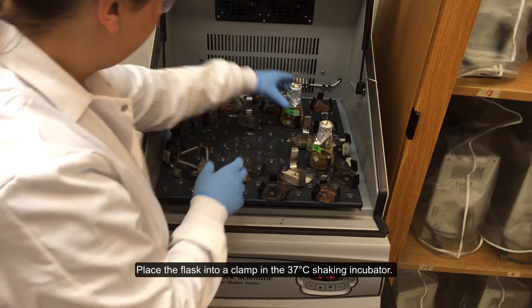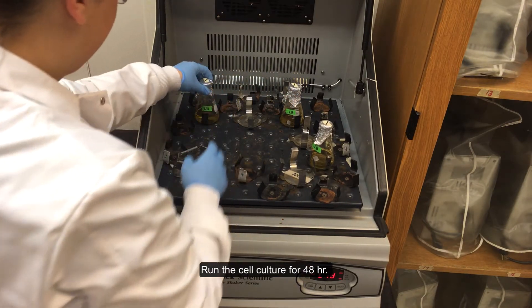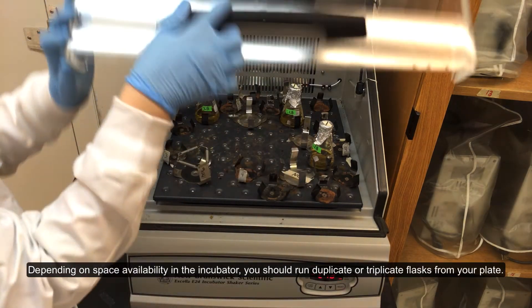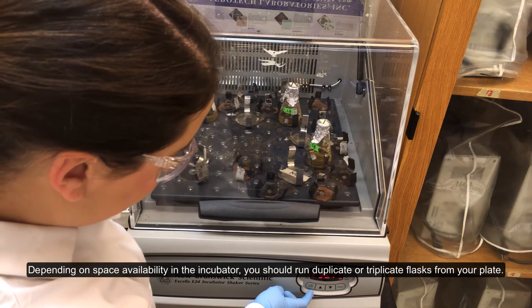Place the flask into a clamp in the 37-degree Celsius shaking incubator. Run the cell culture for 48 hours. Depending on space availability in the incubator, you should run duplicate or triplicate flasks from your plate.